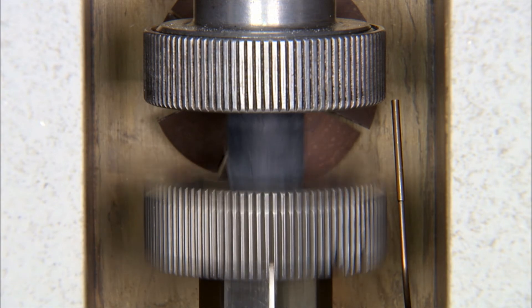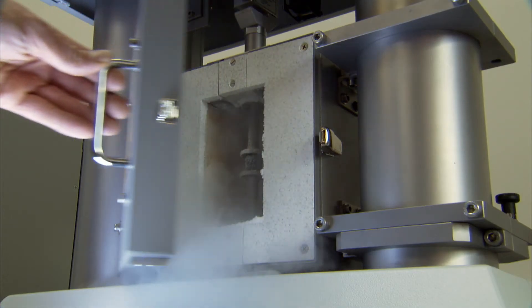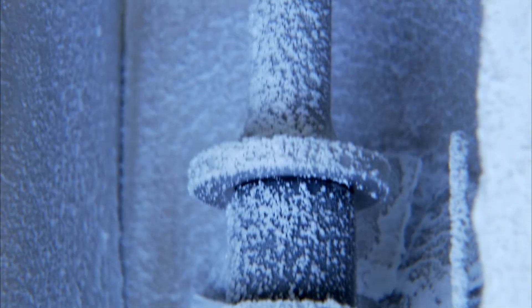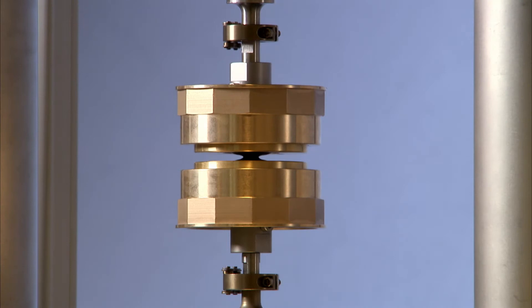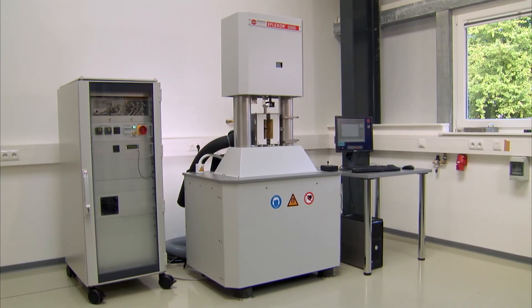For everything from testing dynamic features of rubber mixtures in the tire industry and long-term stability in the sports and construction industries, to assessing textures of foodstuffs, we can develop your special testing solution.